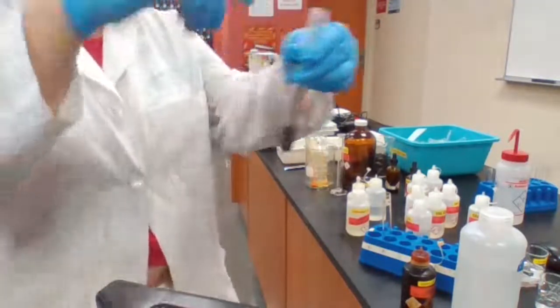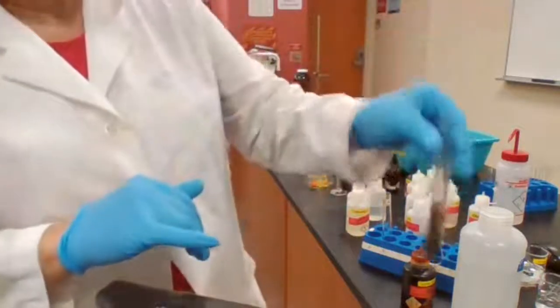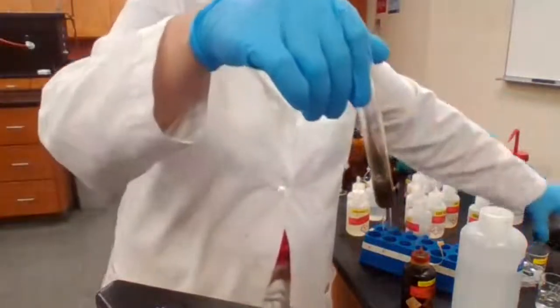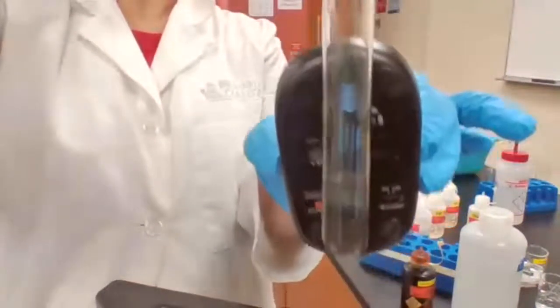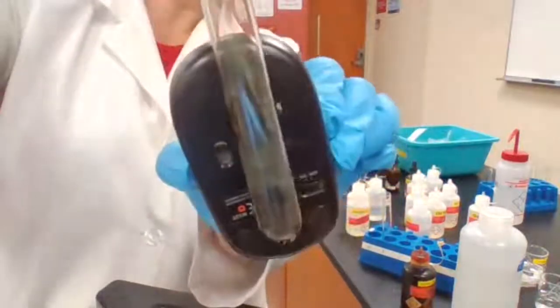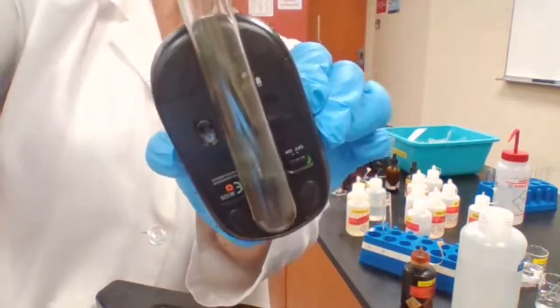Okay. I really wanted to show you the silver that is forming here, the silver mirror, and that's why I left it in the hot water. I hope you can see the top portion of this test tube now. Do you see any shiny part of the test tube that you believe is the silver mirror? Yes?